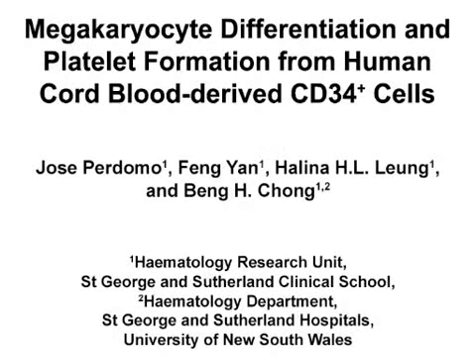The overall goal of this procedure is to use human cord blood samples to isolate pure CD34 positive cells to study the effects of specific drugs of interest on megakaryocyte differentiation, pro-platelet formation, and platelet production. This method can help answer key questions in the megakaryocyte and platelet field, such as what are the effects of specific treatments on megakaryocyte differentiation and platelet production and function.